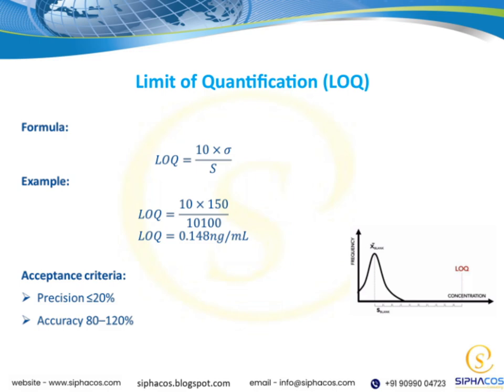If the concentration of the analyte is below this limit, our measurements might not be dependable, which could impact the validity of our data. In the context of our overall presentation, the LOQ ties into ensuring the quality and reliability of our results. It's about knowing the boundaries of what our methods can accurately detect and quantify, so we can interpret data correctly and make informed decisions. Remember, establishing a proper LOQ is fundamental for compliance, especially in regulatory environments, where accurate quantification can be critical. So, always consider the LOQ when designing or evaluating analytical procedures.